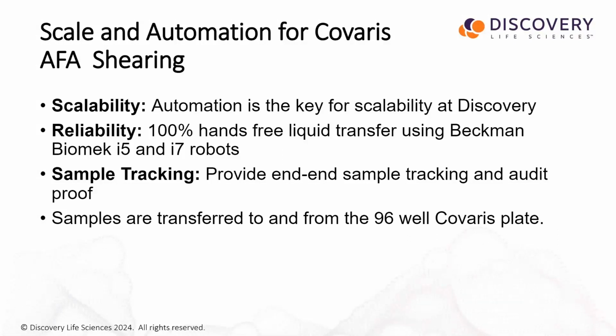Actually, they're prone to sequence bias. They're sensitive to contaminants in the DNA samples, and they require significant optimization based on the input material, input amount, complexity of the genomic DNA, and things like that.